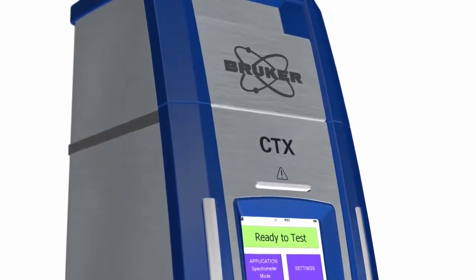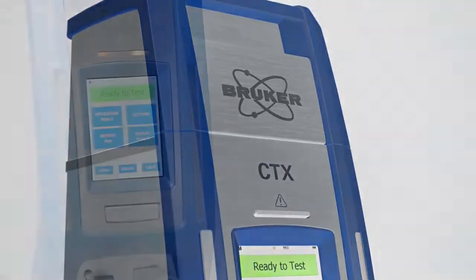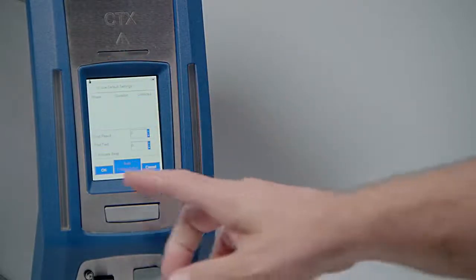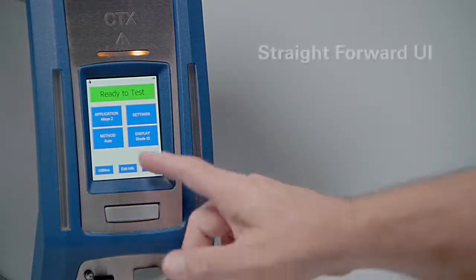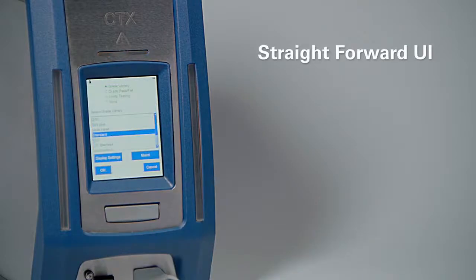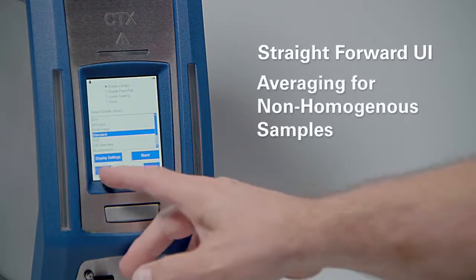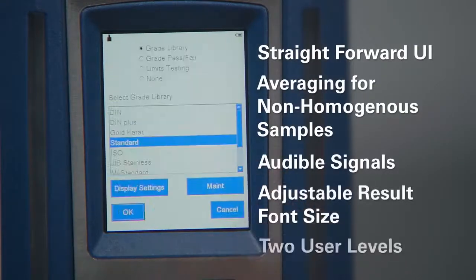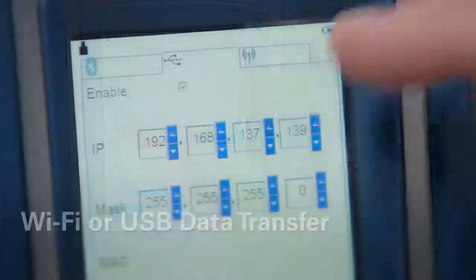The CTX has the same onboard software features as Bruker's proven S1 Titan, including a straightforward user interface, averaging for non-homogeneous samples and batch evaluation, audible signals, adjustable result font size, user levels, and Wi-Fi or USB data transfer.